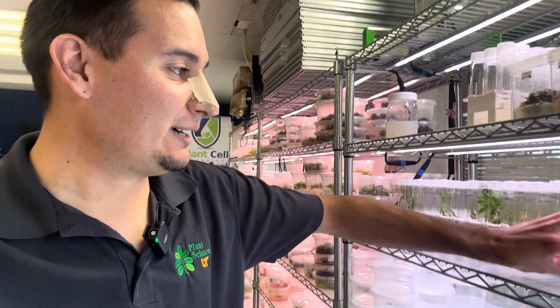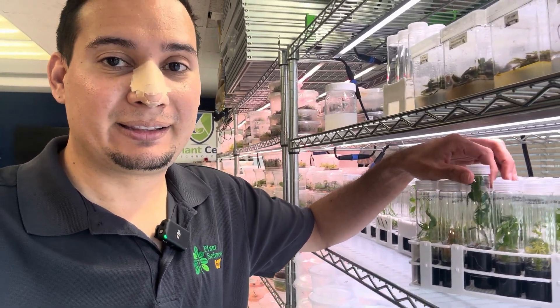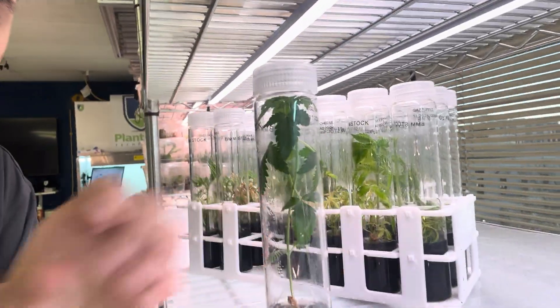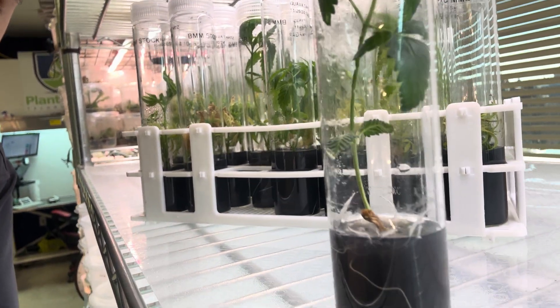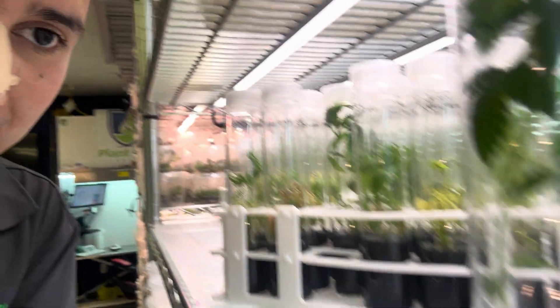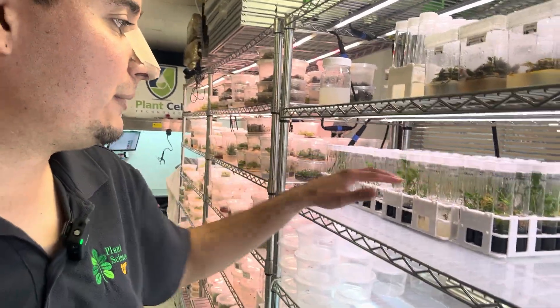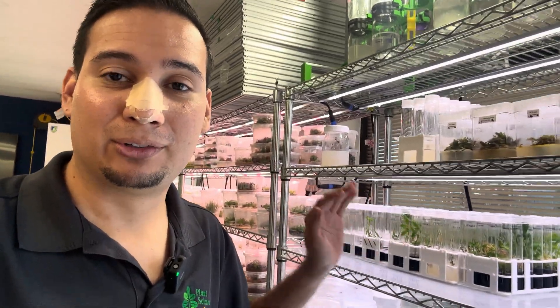Let's start with the spicy tomatoes that we have here. We have a new media and the spicy tomato loves it. Look at this plant — all the way to the top of the test tube, and look at the roots. Amazing results from this new media. I'm still testing some different media variations and plant growth regulators, but so far we have great results with this media.